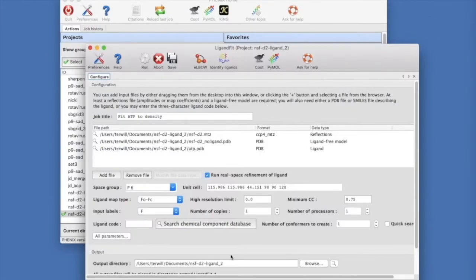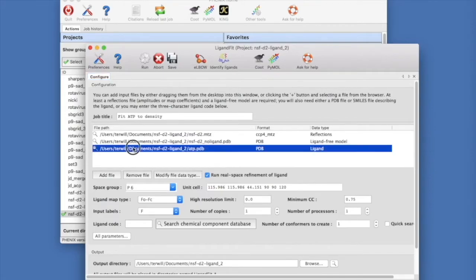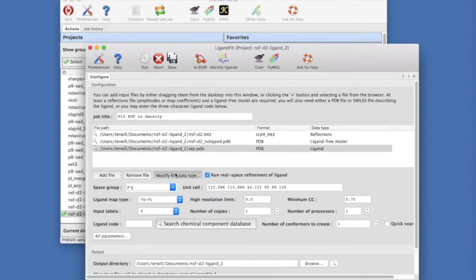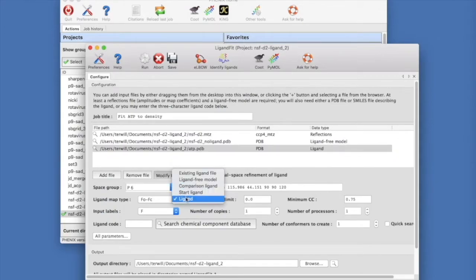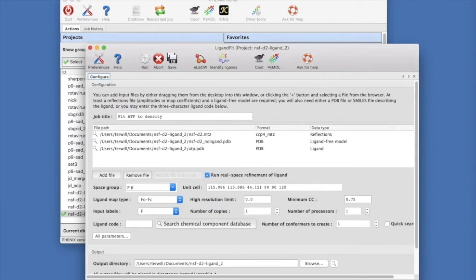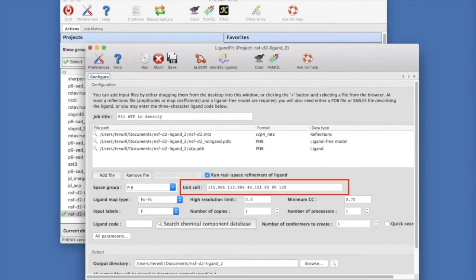The GUI has guessed the data type for each file. If you want to change it, select the file and modify data type and choose the appropriate data type. Notice the space group and unit cell and make sure that they are what you expect.